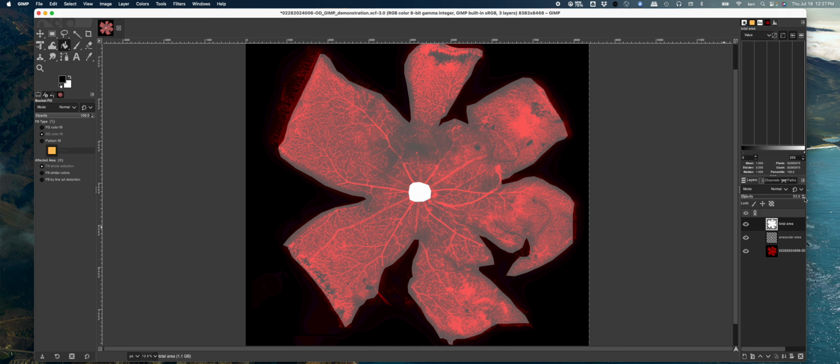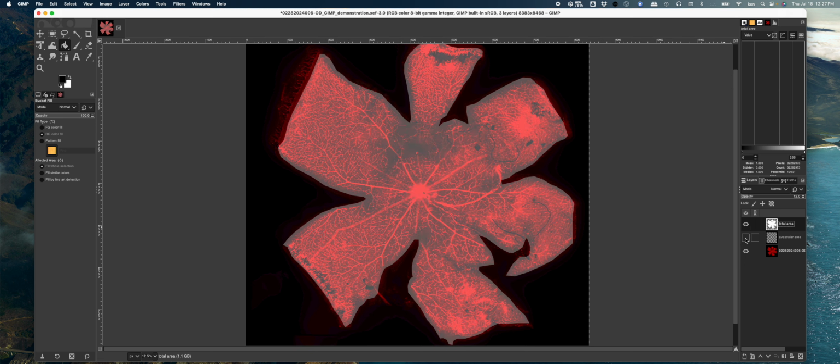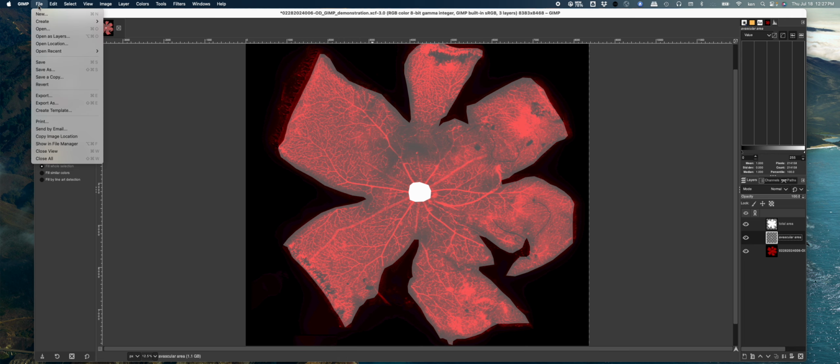When I want to review this and open up this file, we open it up once, we look at this, and immediately we can quality control the tracing. I can look at it and say, oh, it looks like that was traced well by whoever did it. I can flick some of these things on and off. All the information's there, and I can double check that all the numbers that were taken have come from these areas. So I'm just going to make sure I save that file again.